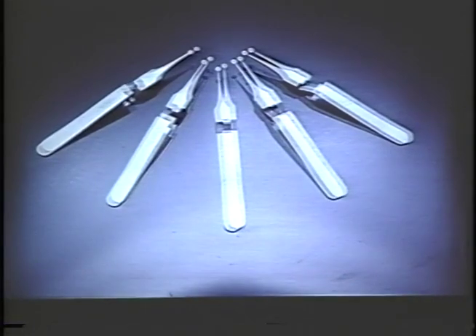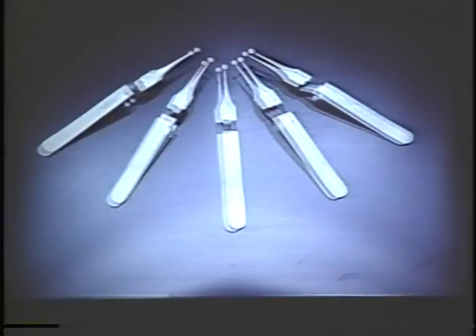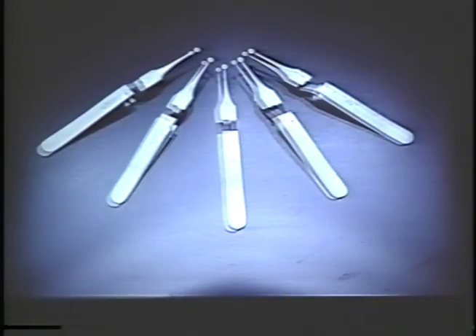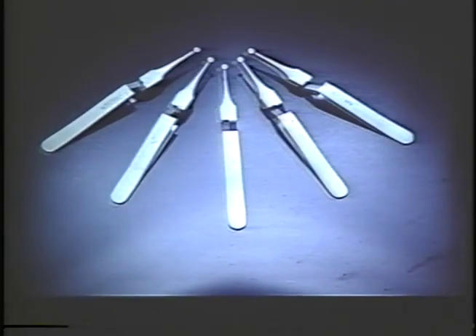After the grid is loaded with sections, you want to avoid wrinkles on the grid or on the section. A method I've used is to just put the grid into some negative action forceps and let it sit and air dry under a beaker or something to prevent dust from getting on it. Recently, I saw a little technique paper by Hildegard Crowley in which she puts the drying grids into a light vacuum. According to this paper, the light vacuum helps to prevent the formation of wrinkles in the sections. I haven't tried it yet, but it's something I'm going to try.